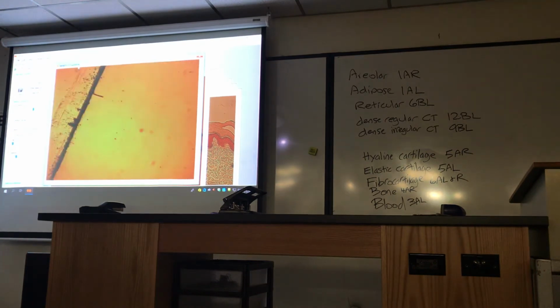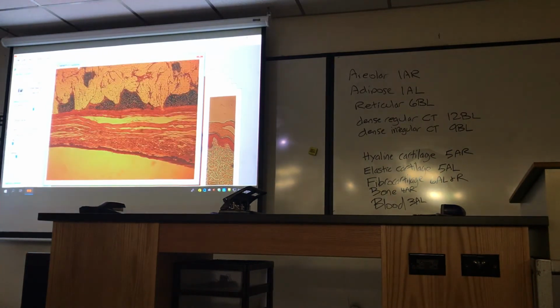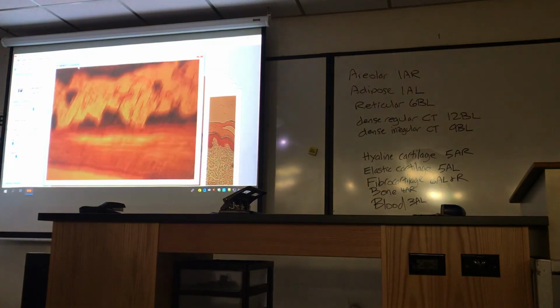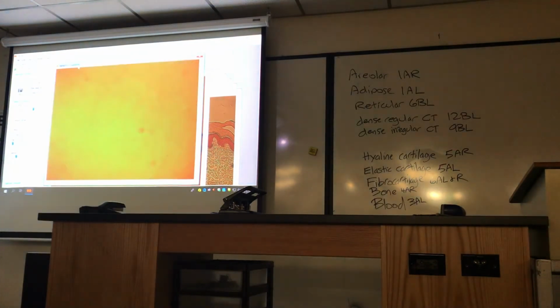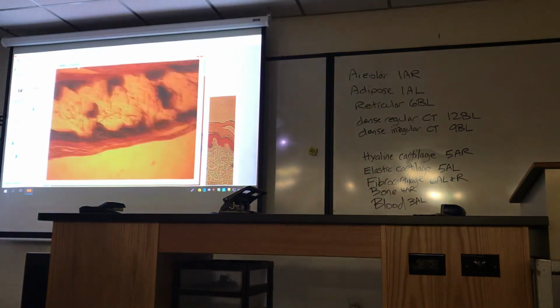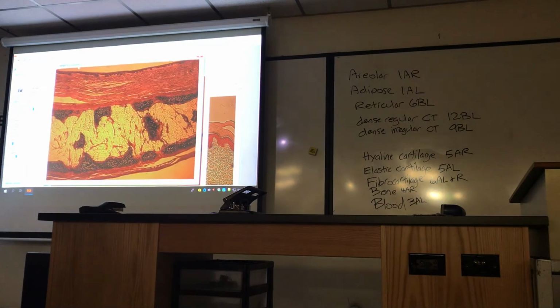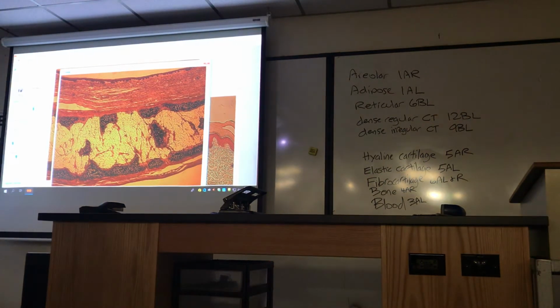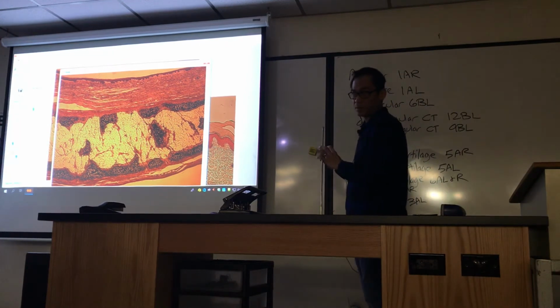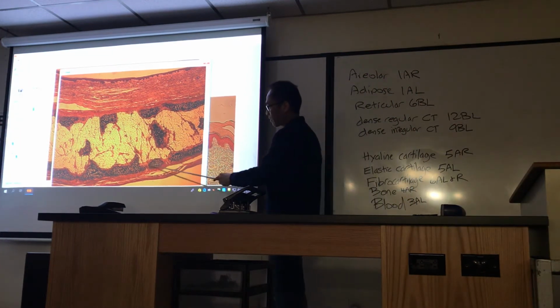I'm going to show you 3 tissues here in addition to the elastic cartilage. Let me put the slide right side up. Here's a Lomag. So let me point out the 3 tissues I'll have you identify. The elastic cartilage, do you see the darkest tissue? The darkest tissue is the elastic cartilage.